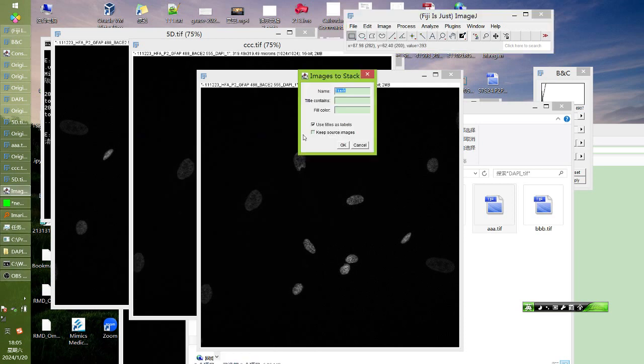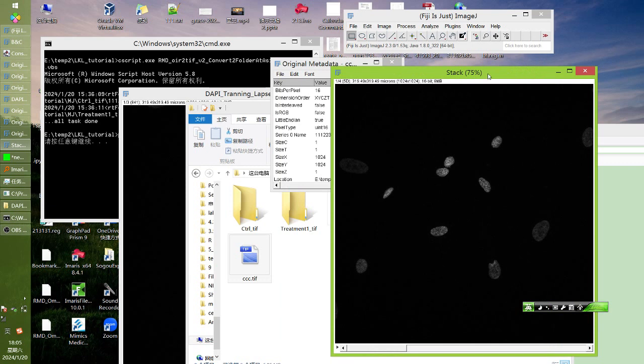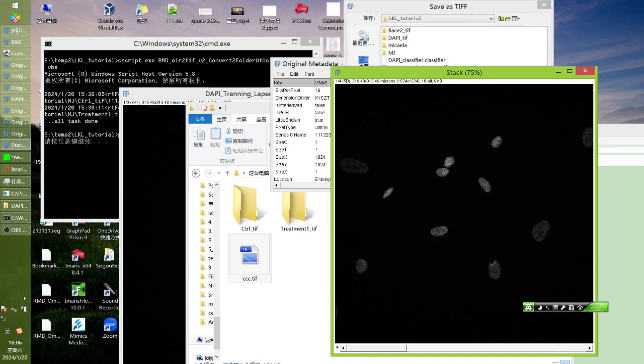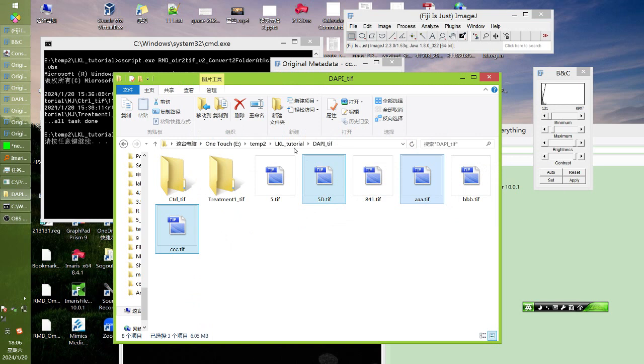When we get a second training, we first save it. DAPI training labs, second part. Okay, we close it.